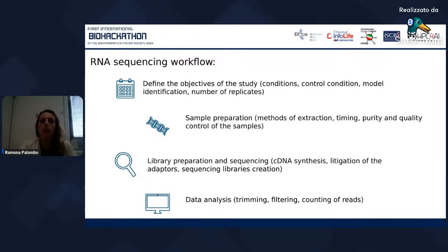So when I extract RNA from a specific tissue or from cell culture, I could have different yields in terms of quantity of RNA, but also in the quality of the extracted RNA, because the stability of RNA is not so long, and we have to choose also the right conditions in the extraction, just for timing, but also in the buffer conditions and also in the temperature.